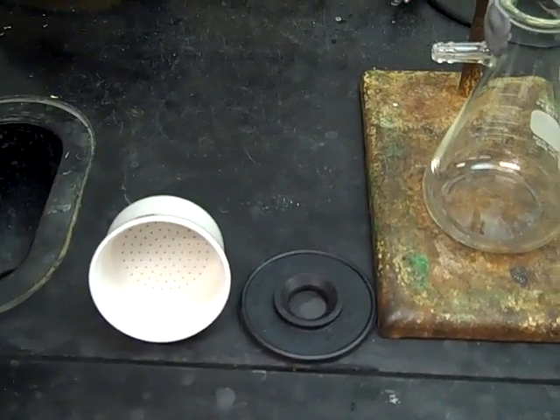I hope you guys are enjoying the laid-back atmosphere music as we get started. Here's our equipment for the vacuum filtration.